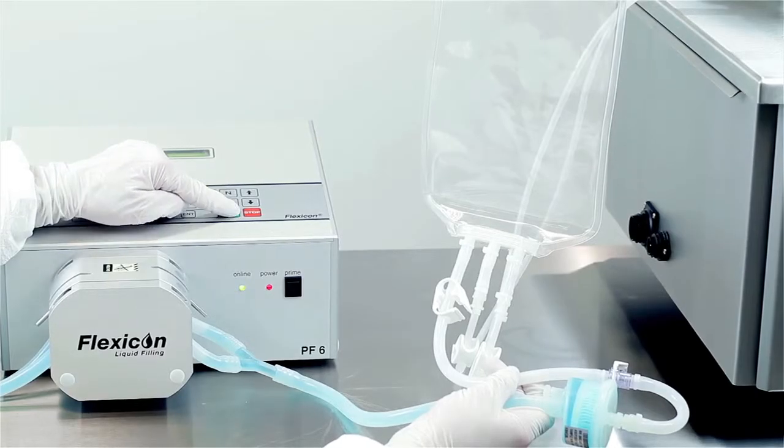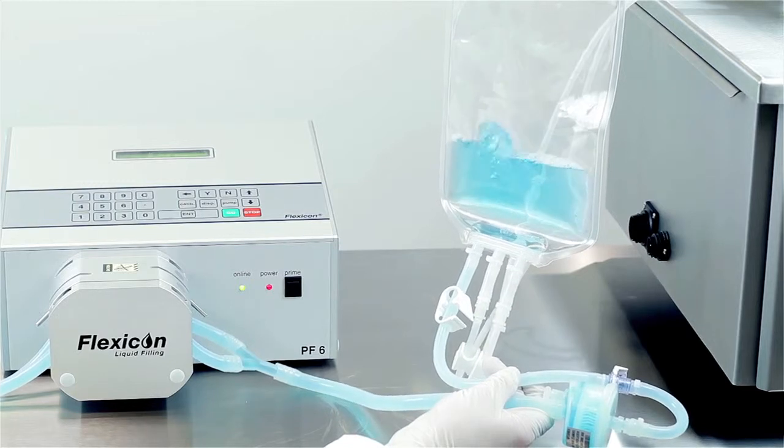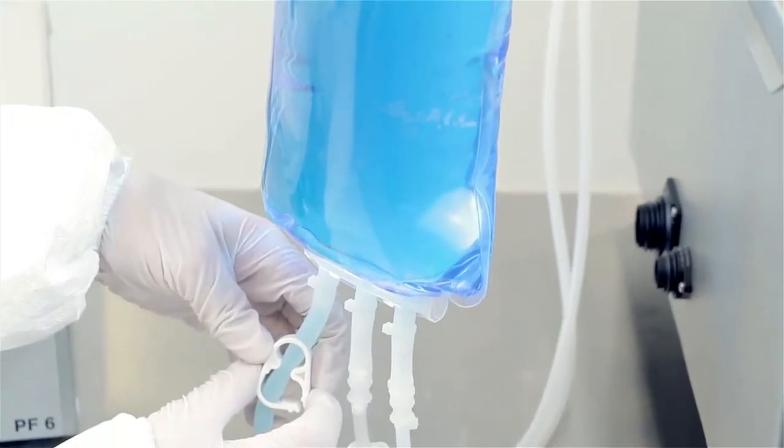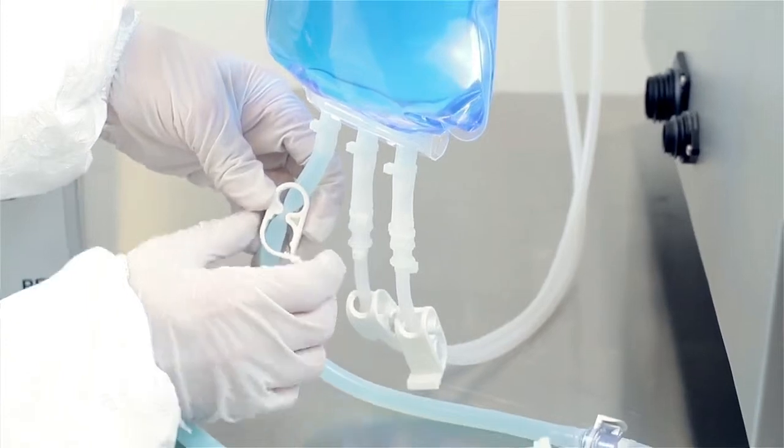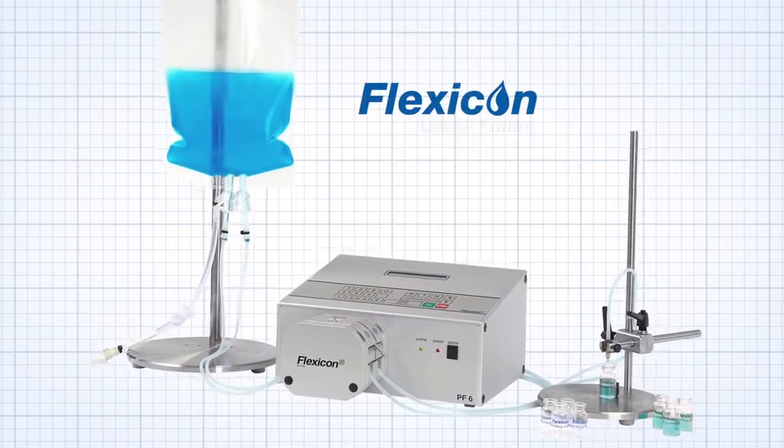The PF6 has been optimized to work with AccuSyl Platinum cured silicone tubing. This type of tubing delivers accurate dispensing and is an important part of the total filling solution ensuring that costly overfilling is prevented.